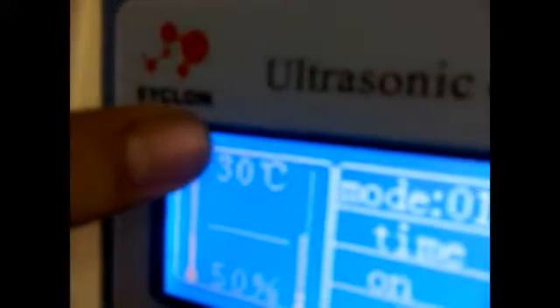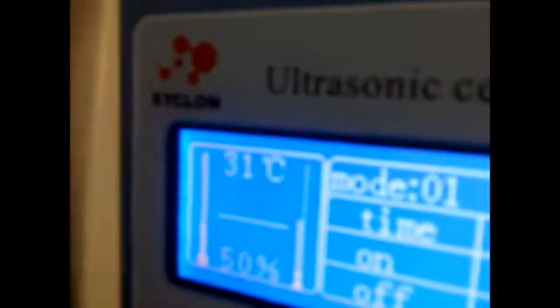Here you may see that the temperature is rising. It has come to 30 degrees. Once it will reach 50 degrees or above 50 degrees, the machine will stop so that your sample should not get spoiled.